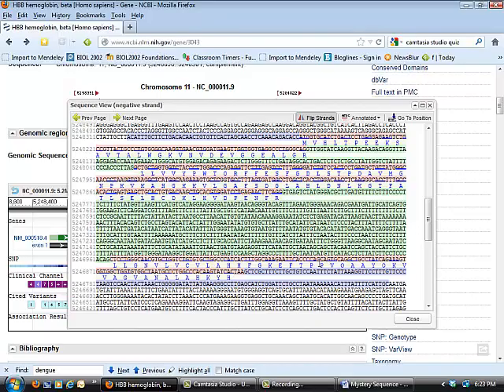How many introns are there? How many exons are there? How big is the gene? What chromosome is it on? It's up to you. Just find any gene that you're interested in and practice these skills, because I have no doubt they will come in handy in your future.